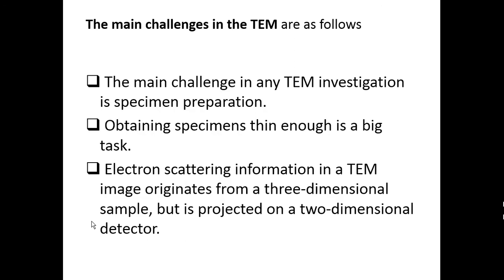But even with such challenges, we can still obtain the information by preparing the specimen, because technological advancement is such. So TEM is still a very good tool for characterization of nanomaterials, nanostructures, nanosystems, nanofilms and all. So I think with this we conclude TEM here.